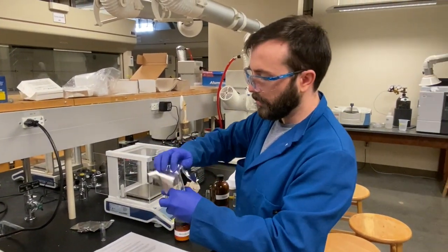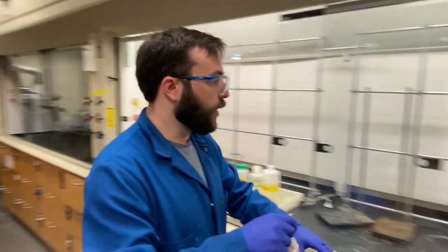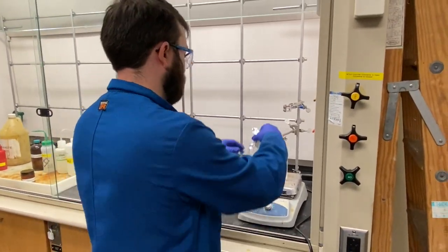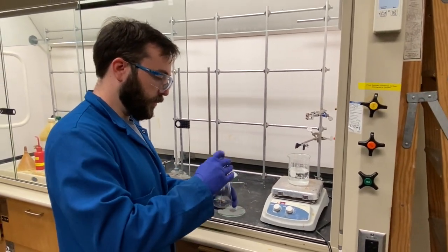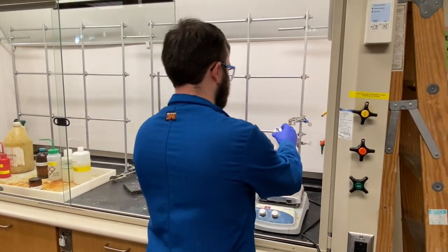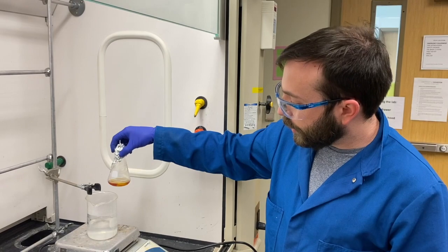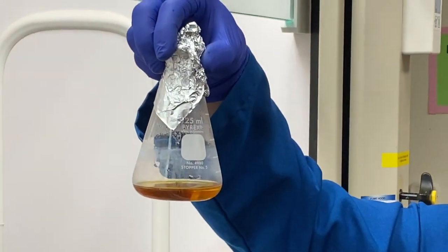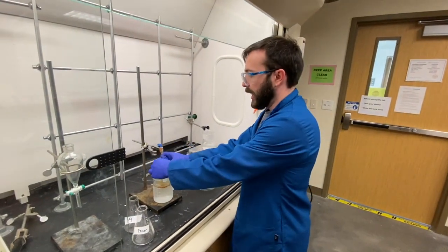Then loosely covered with aluminum foil and placed in a boiling water bath with a stir bar. After one hour of stirring in boiling water, the solution has turned dark amber.